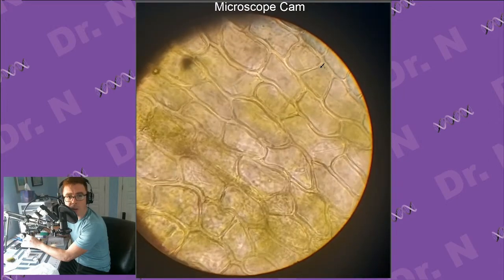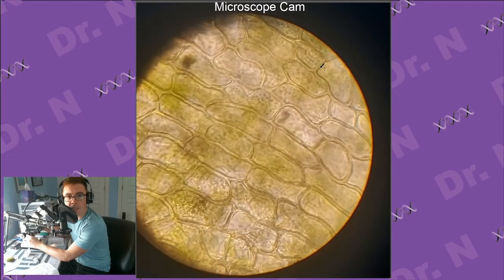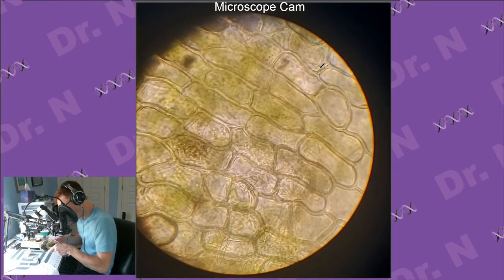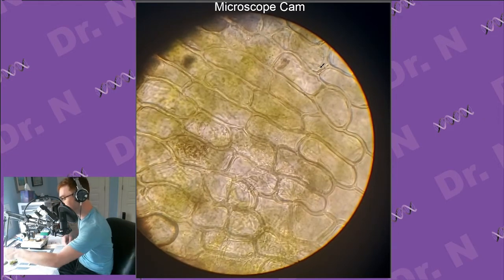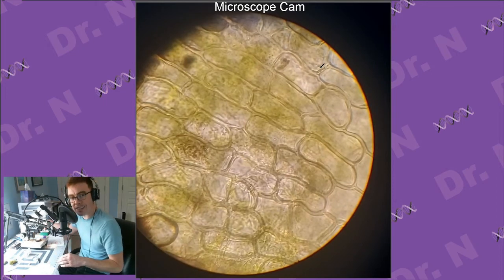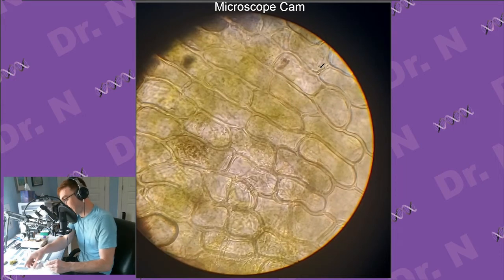So I am just going to pause on this guy. I'm going to agitate and suck up some of the liquid. Oh, actually, here, I'll take some from the lichen, which again, I don't know if there's actually anything in it. It was very dry. Maybe if there were things living on it, they needed to rehydrate for a longer time than I'm going to give them. But we might as well check.